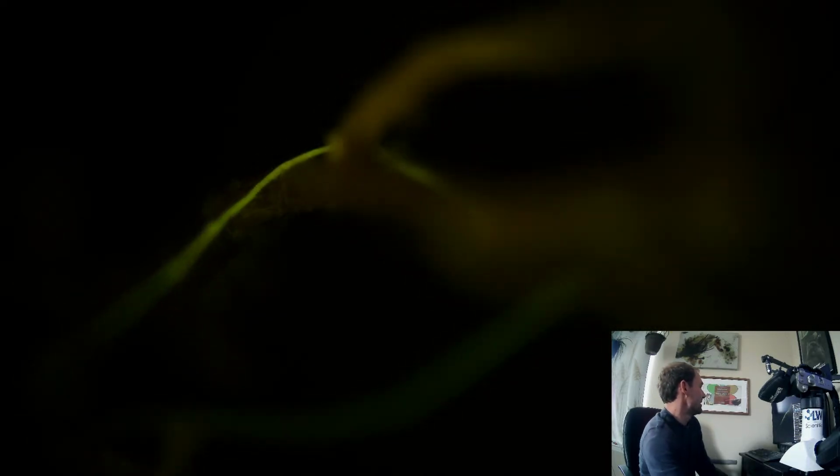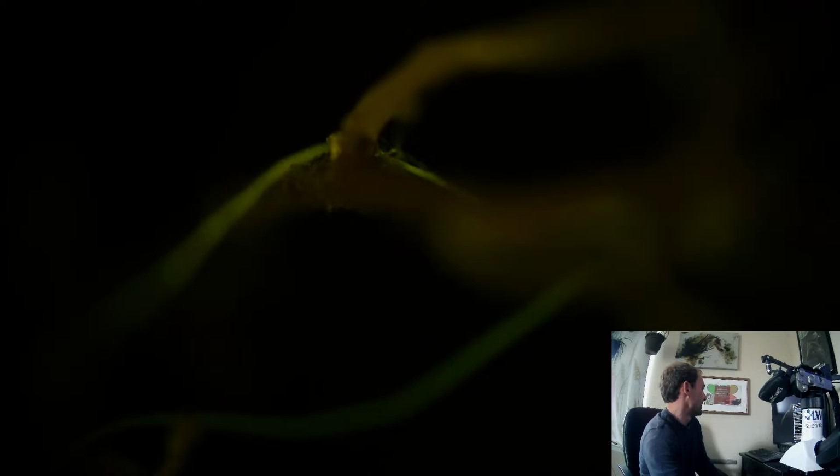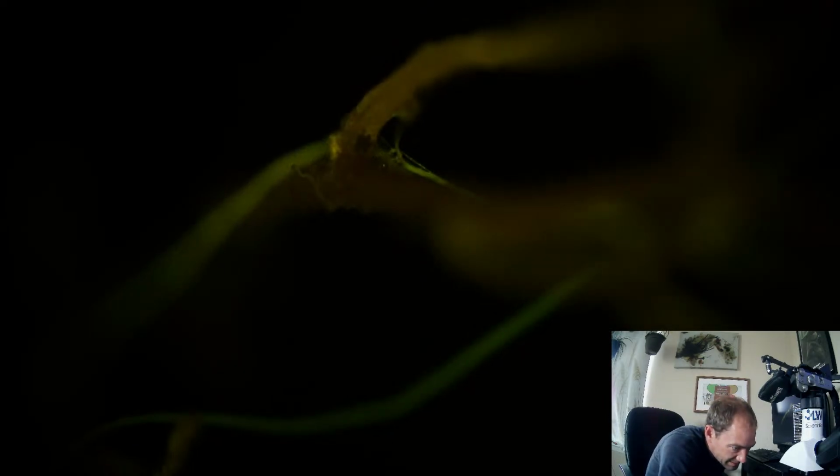Or it might be a piece of... I don't see any septi in it. It would be a very large fungal hyphae, but no, I think that's just a... Yeah, it's getting smaller towards the end, tapering off. Definitely a root. That's interesting. All right, where are we on this? This thing goes all over the place.